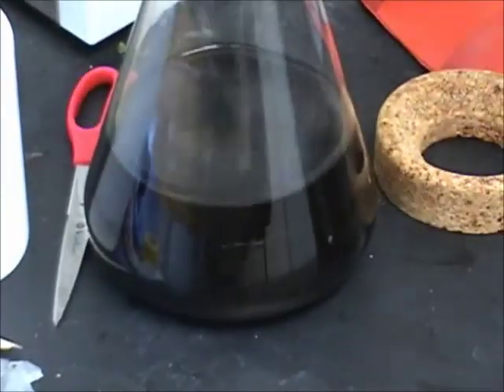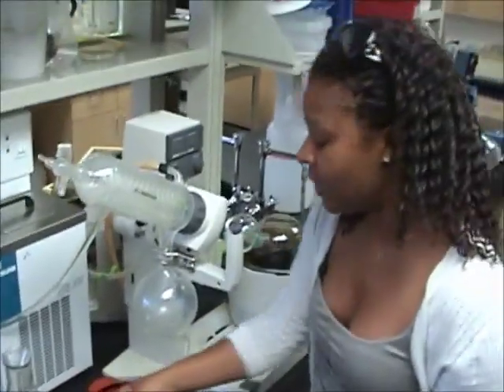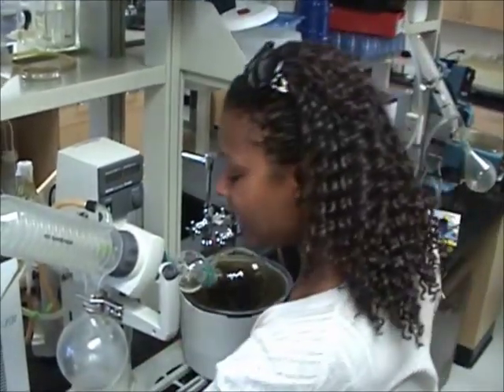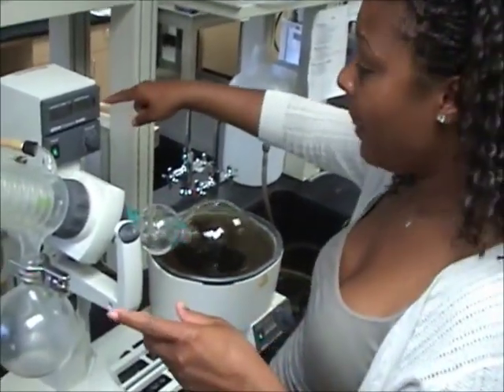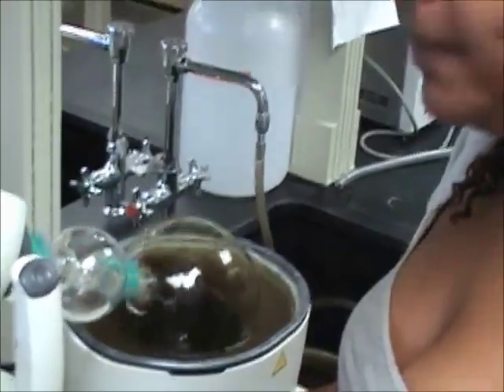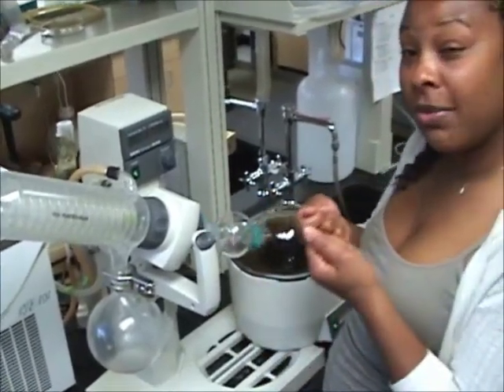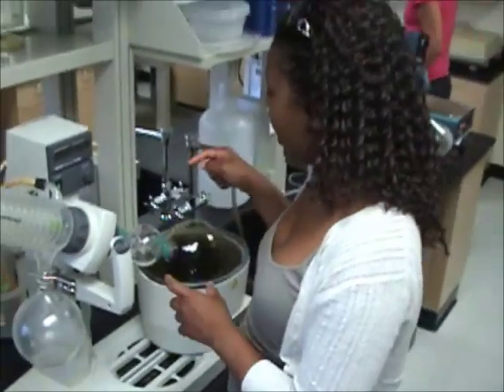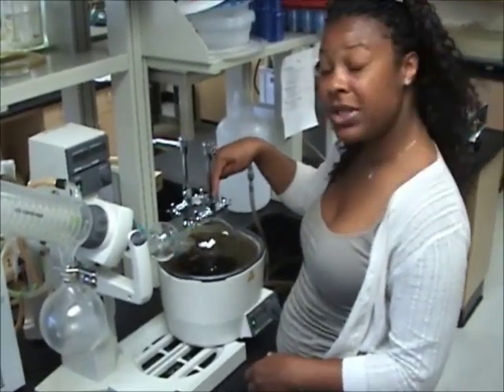This is after that composition sat for three days — you get this liquid. What we're doing with this machine is taking this fluid and pulling out the chemical we're interested in. In this tube, we heat it in rotation. The ethanol and water come out into this little bottle — so you're making a distillation. We used the ethanol and water to change it from a powder to a liquid, and now we heat it to extract the ethanol and water back out, which comes from this bottle, leaving us with the chemicals we need.